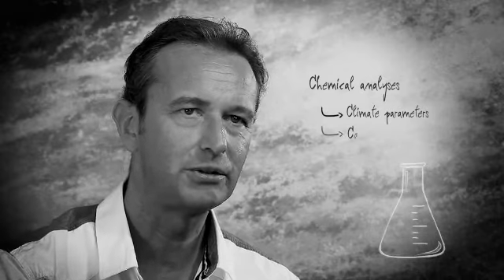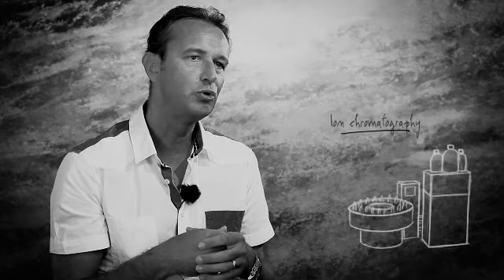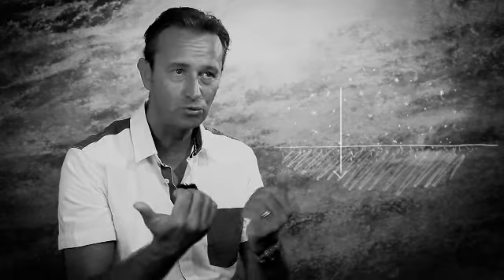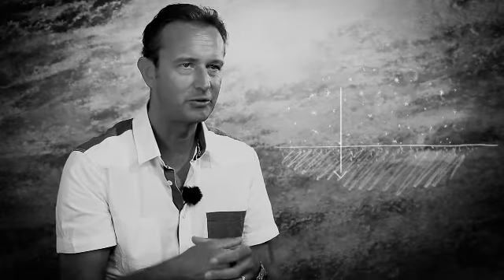Another way of working on the ice is to conduct chemical analyses, which allow us to reconstitute all the parameters that are factored into the climate or the composition of the atmosphere. Different devices are used, like ion chromatography. They measure aerosols and impurities in the atmosphere, which will be incorporated into the snow and thus into the ice core during precipitation. We'll also measure these famous air bubbles, which contain a sample of the atmosphere's gas composition.